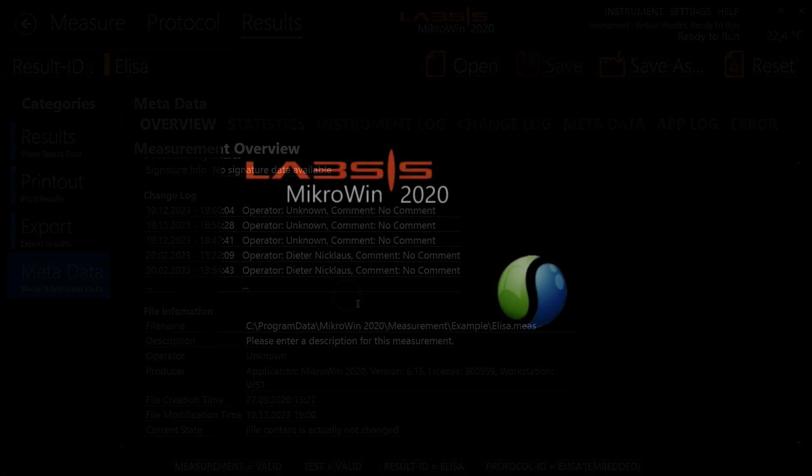So much for our overview of MikroWin 2020. Thank you for listening and good luck with your work with MikroWin.